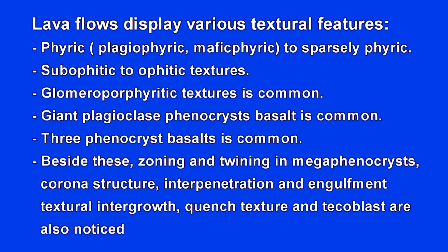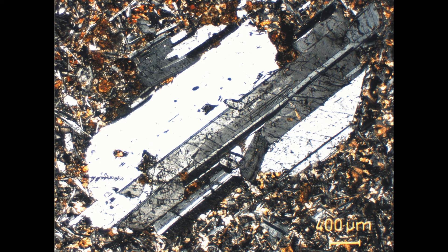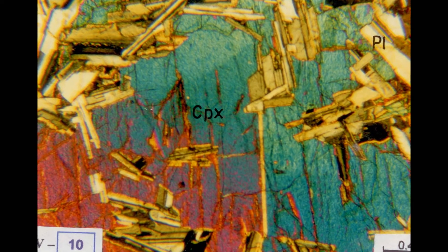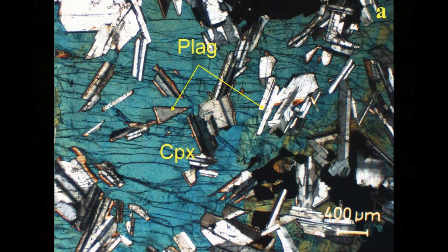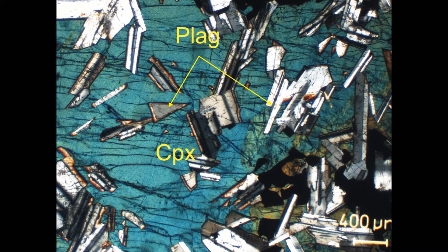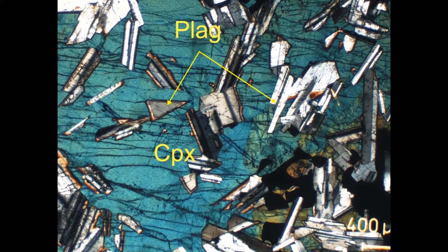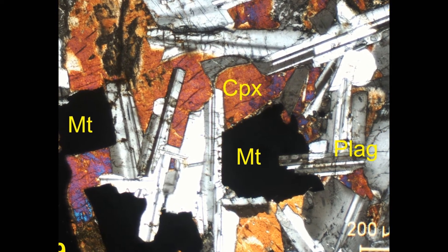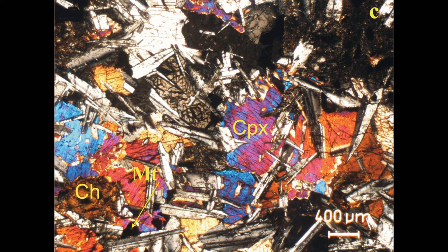Lava flows display a variety of textural features such as phyric. Phyric means you have large-size crystals. If you have large-size plagioclase crystals, we call it plagiophyric. If you have large-size augite crystals, we call it maphic phyric. These rocks also display ophitic texture — a large-size crystal encloses smaller, tiny crystals within it. When crystals are only partly enclosed, we apply the term sub-ophitic texture.